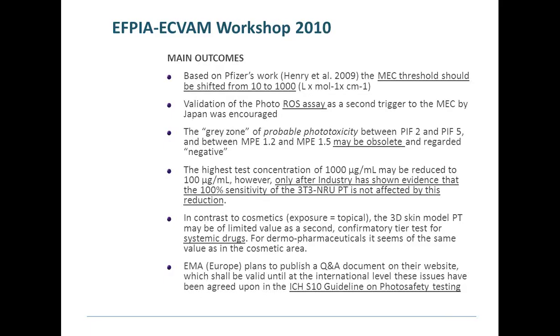It's obviously too much, but before the pharmaceutical industry shows the data, regulators would not accept going below this maximum testing concentration if it can be achieved. If you look at the ICH guidance, it says it can be lower if your biokinetic data show that the concentrations reached in the tissues are much, much lower. Then they would not request, even if it is doable, these incredibly high concentrations.